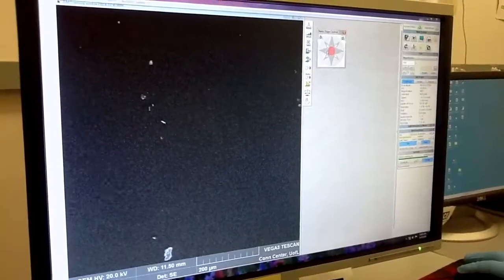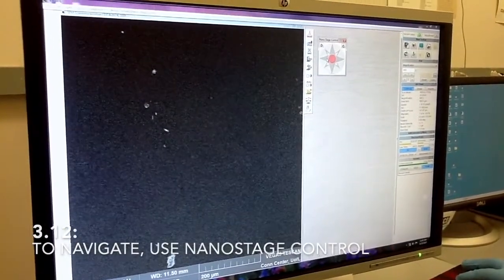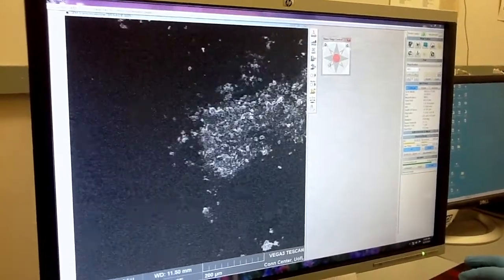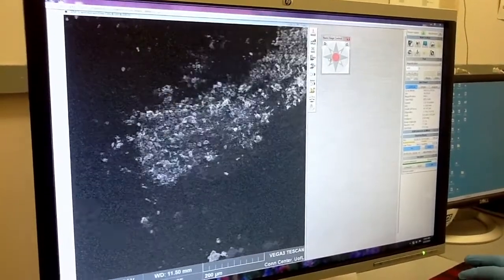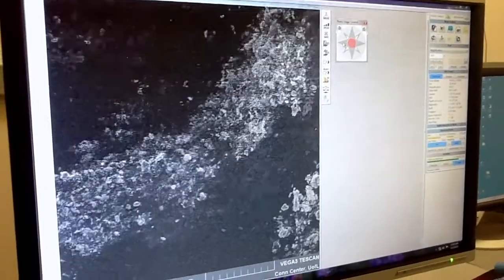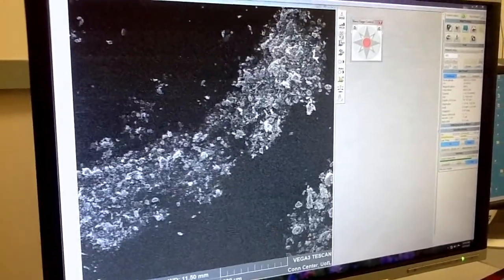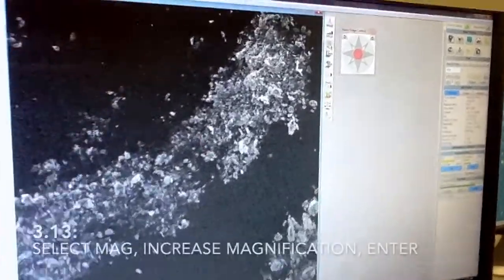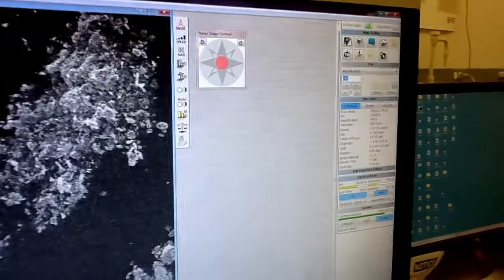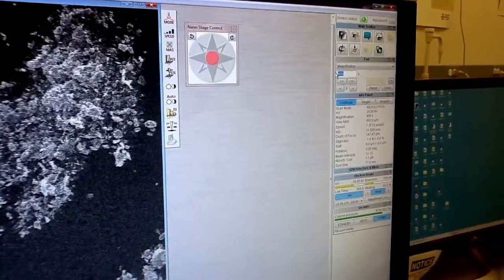If you want to move around, just use the nano stage again to bring part of the sample which has some interesting features — like particles here. You can now increase the magnification; let's go to 2000.